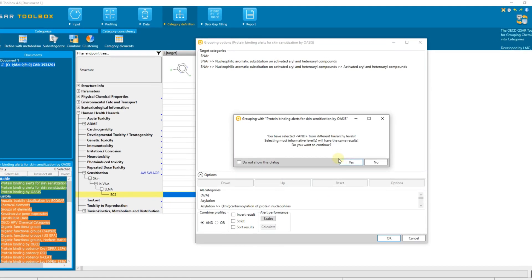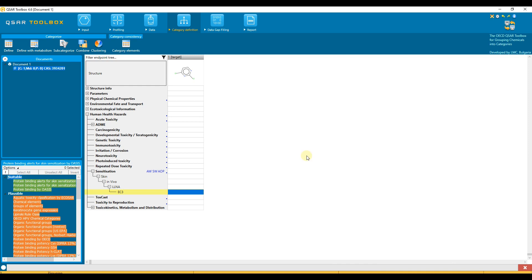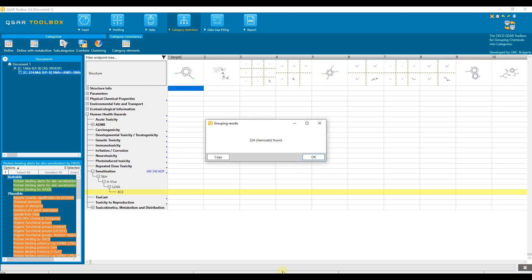A message will appear stating that the logical AND is being used. If you do not want to see this message again, select 'Do not show this dialog' and confirm. The process of collecting analogs begins and it will take some time to complete. Finally, the chemicals found will be displayed in the data matrix, or a message that no chemicals were found will appear. In the current case, 224 chemicals are found.